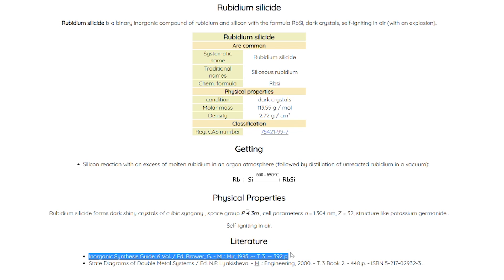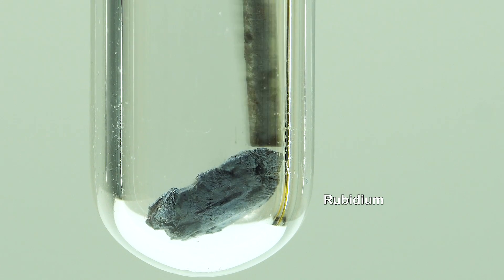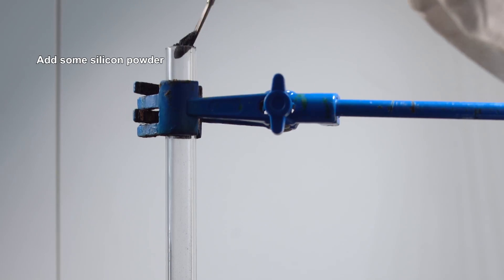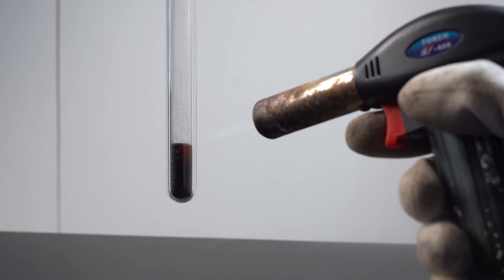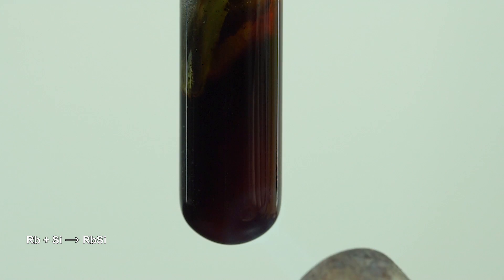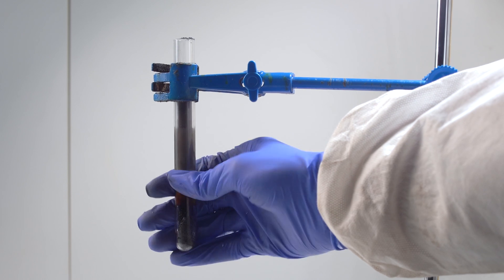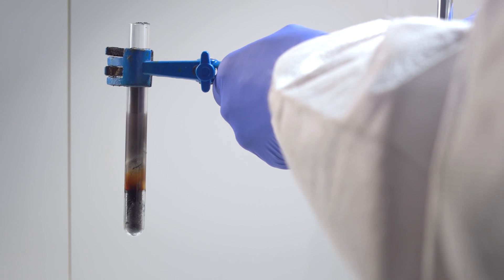According to an Inorganic Chemistry Guide, rubidium silicide self-ignites in air and explodes. Let's check it out. I took a piece of metal rubidium and put it into a quartz test tube with silicon powder on top, adding excess so that it will prevent rubidium from oxidizing — important because I will perform this reaction in a non-protective atmosphere. I waited till the test tube cooled down, and now I'm pouring its contents out, hoping to see self-ignition and explosions.